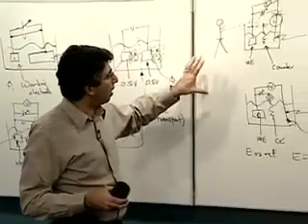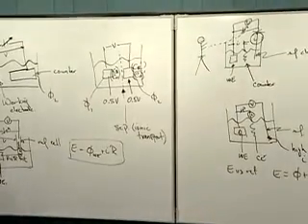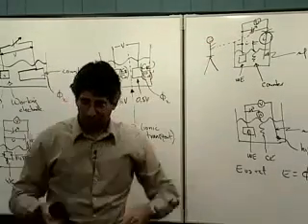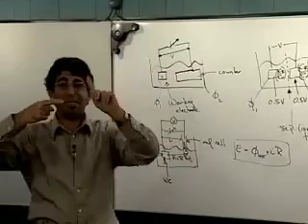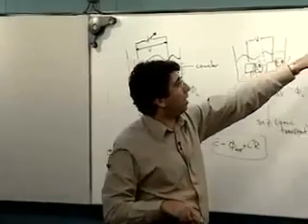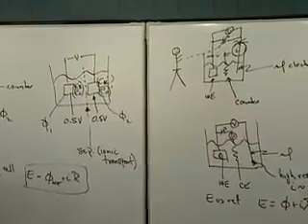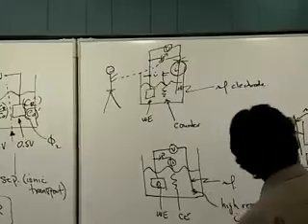They didn't have a student in there. What they had was a little mercury battery, which holds a very constant potential for a long time. Turns out not from 1950 to 1980, but a long time. And they balanced off the potential coming out of the reference electrode against this battery. And there was a voltmeter, and as this voltmeter turned, instead of having a needle on it, it had a pulley. And this pulley had a rubber band wrapped around it that went to a knob on a power supply. And so if the voltage got away from what the battery was saying, then that would cause this null reading to turn, and turn the pulley, and it would turn the power supply. It's hard to believe it worked. It probably didn't. That's why it was in the sub-basement. But you could do it that way, sort of.